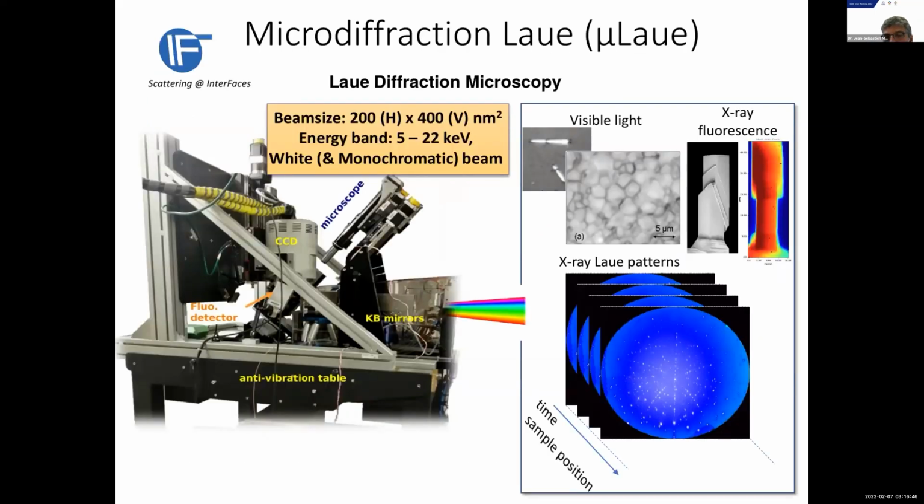Okay, how is it done on the BM32 beamline? We now have a new camera which is black, but it is more efficient than the CCD technology. Now we have an sCMOS, scientific CMOS camera, with a smaller readout time and also smaller noise. So this is perfect for our experiment. And this camera is looking at the sample that you don't see, but the sample should be there.